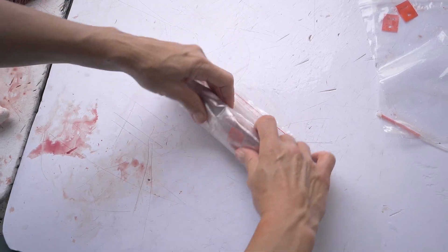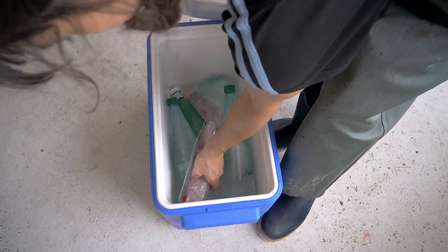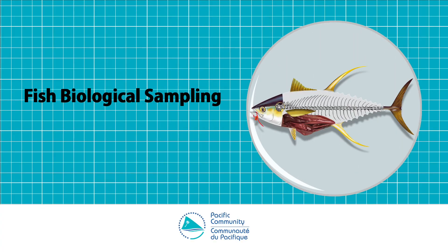Always place your sample away from the sun. If you have a small cooler with ice, place your sample inside it straight after the extraction. That's it for today! You can check the other videos for the Pacific Marine Specimen Bank Sampling Project. Thank you!